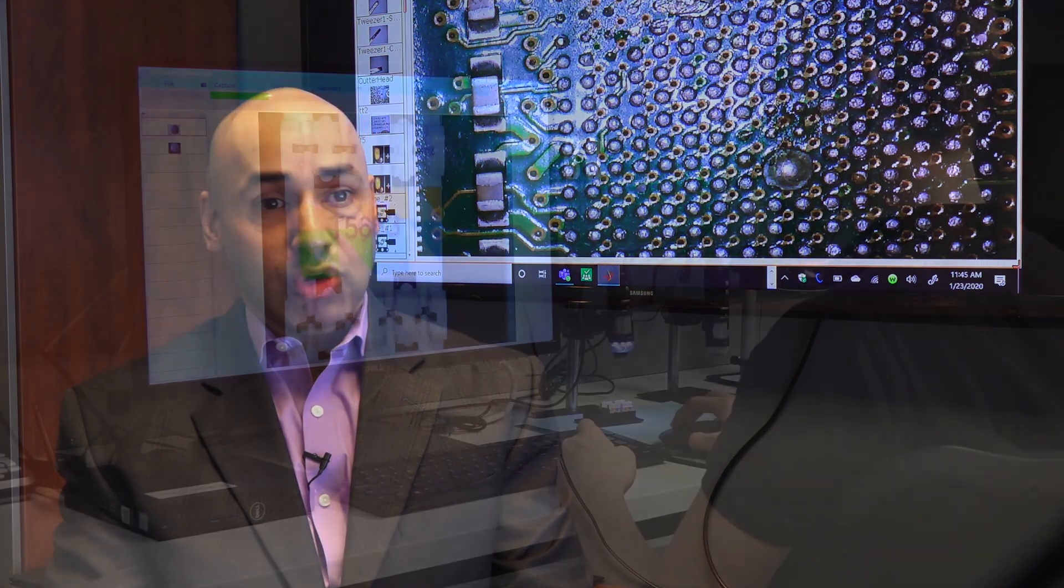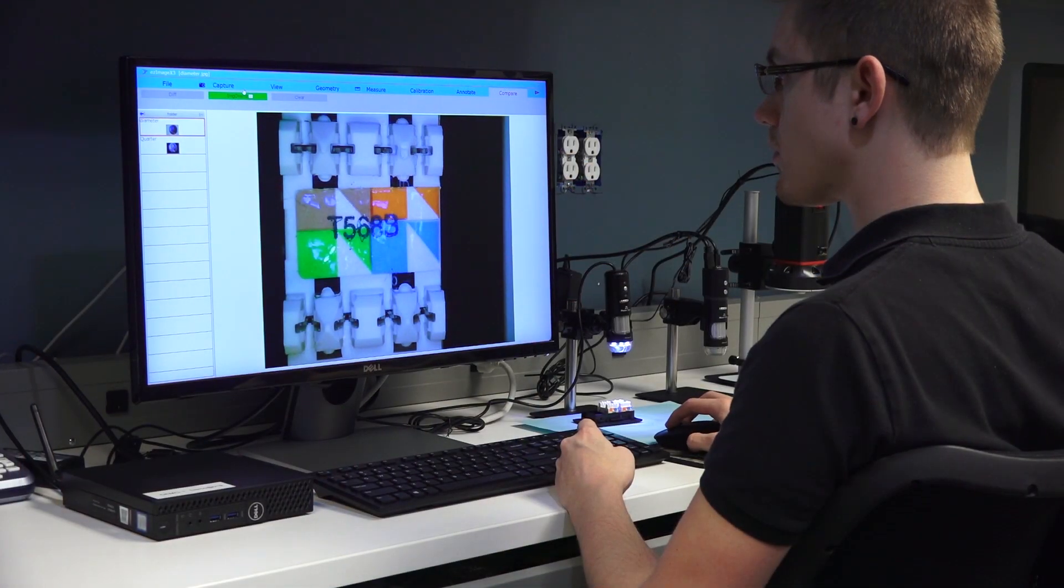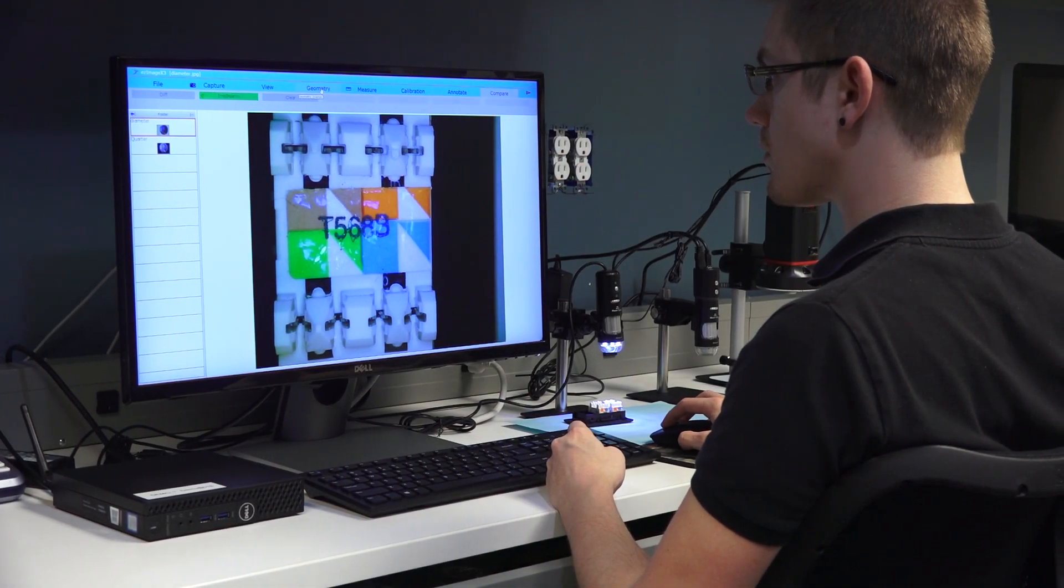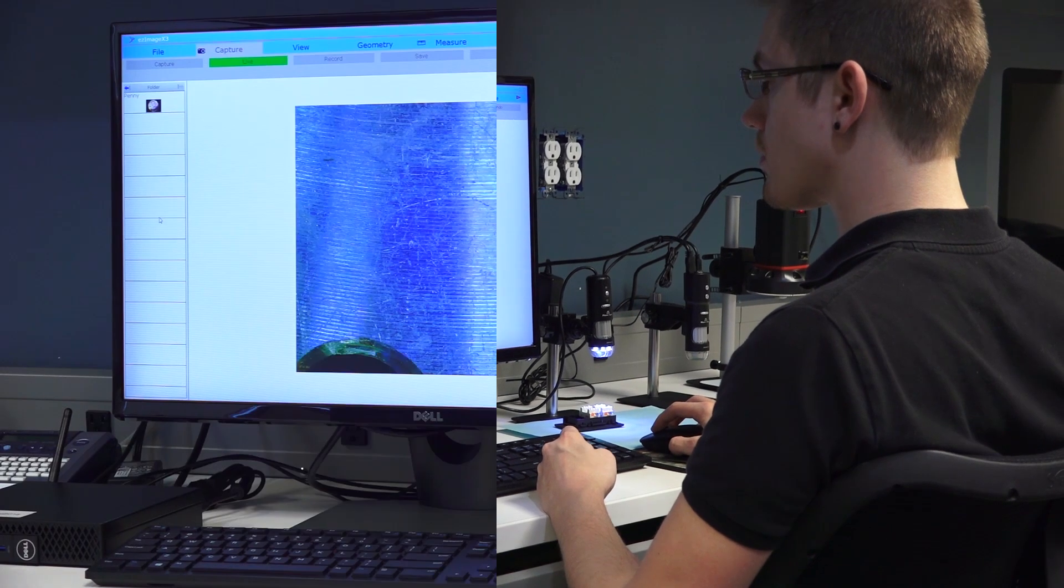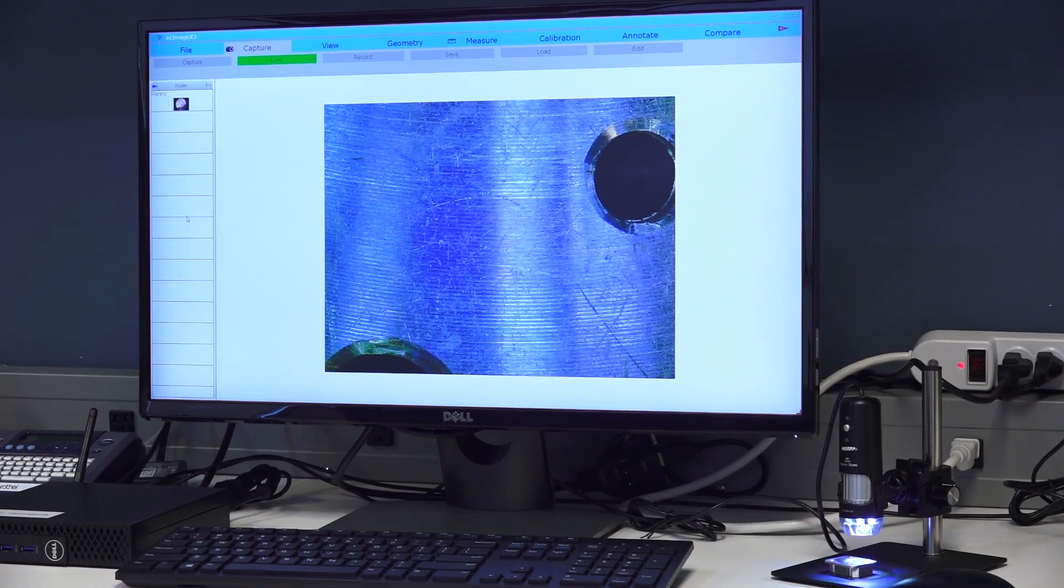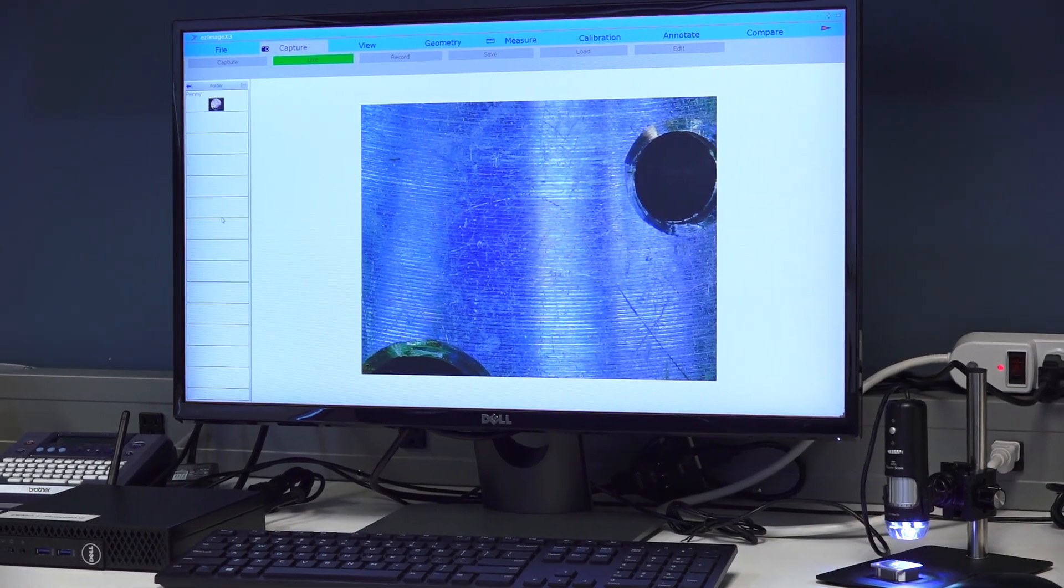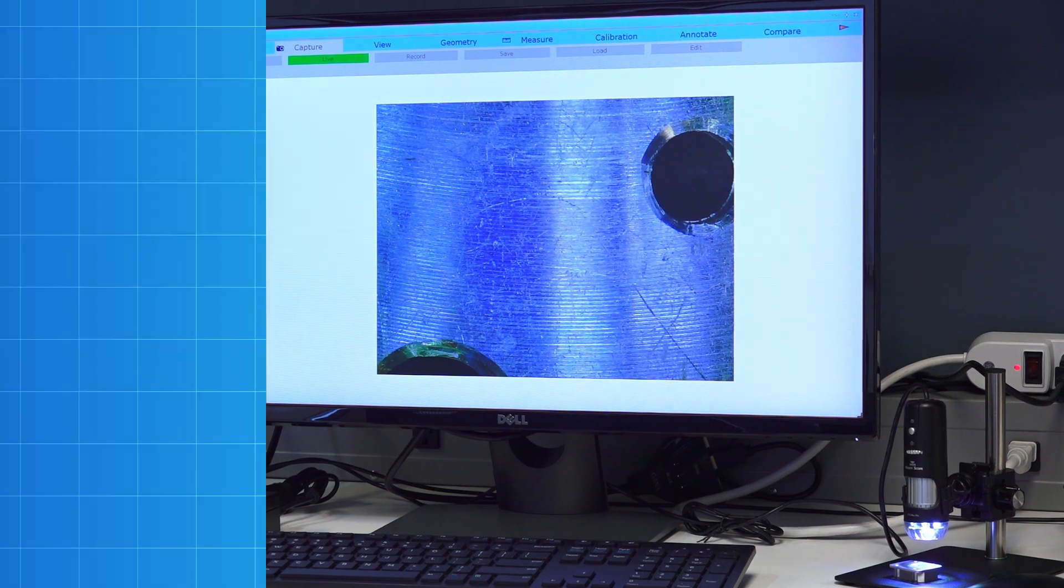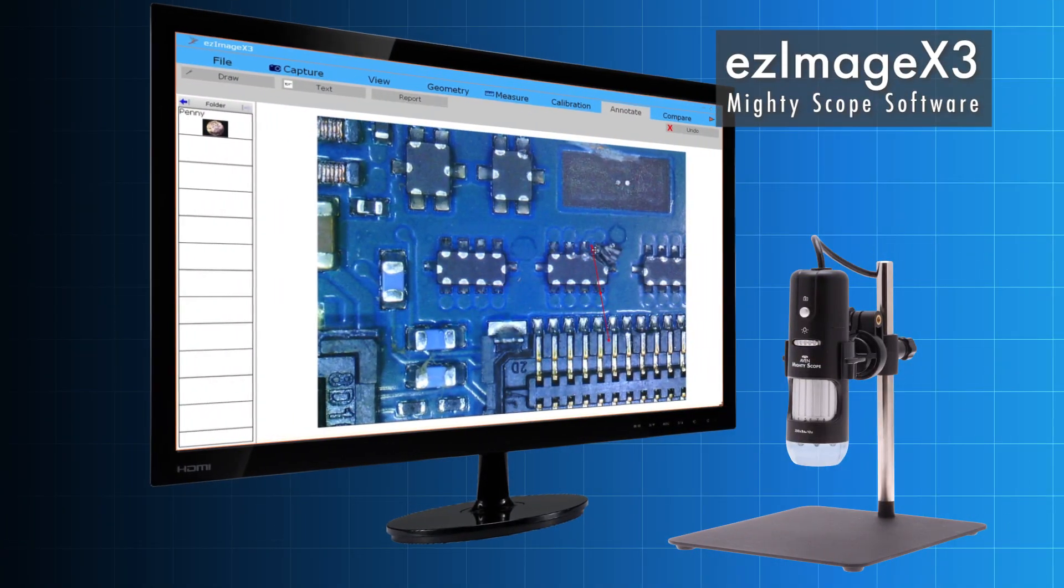Easy Image X3 is the culmination of three years of listening to our customers, taking their feedback on new features they wanted on top of Easy Image X2. As customer needs evolve, we evolve with the program as well. Today we're proud to offer the latest upgrade in precision inspection, Easy Image X3.